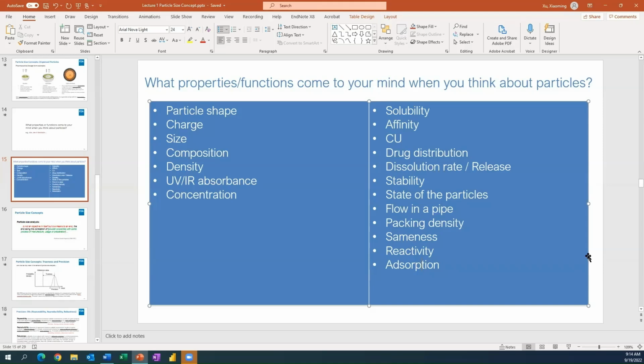Similarly, in some other situation, we care about the stability. We want to make sure that the product does not show aggregate formation throughout a 2-year shelf life. We want to make sure that we have an adequate method to detect the presence of aggregate formation. So in this case, our goal is to detect undesired formation of particles. So in almost every single situation when you are measuring particle size, there is a purpose associated with that measurement that is not the purpose of measuring size.